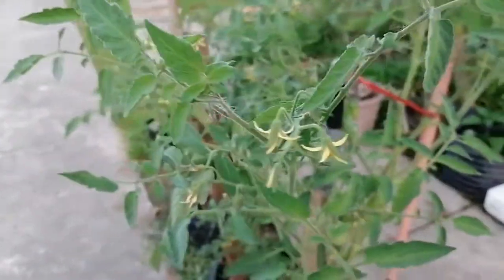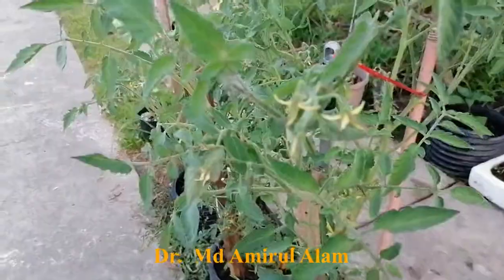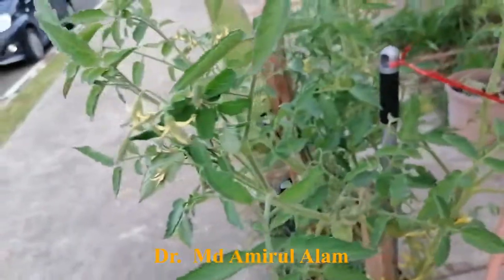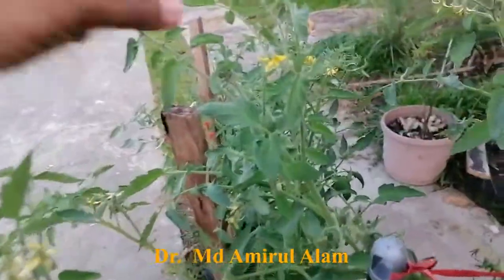Dear students, I'm going to show you how to do hybridization in tomato. Tomato is from the Solanaceae family and the tomato flower structure is almost different from any other flower. I'm going to show you how they are different.